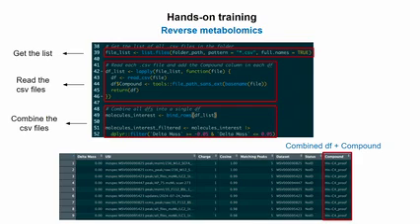So this is the column that you have here. We'll create a new column called compound, and it will list the file name that you choose. So if you call it histidine C3, it will take that name and fill that column with it, so we know which USI is matching to which compound. And this is important when you generate the heat map, to know which compound is associated with which biofluid or body parts.